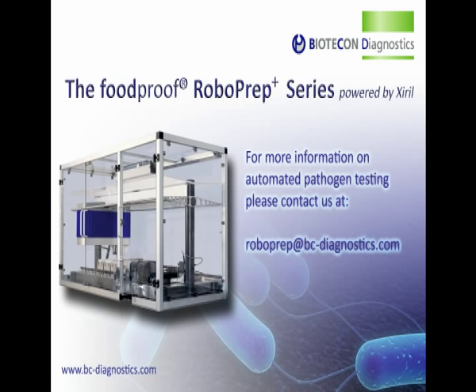In total, the entire automation process of DNA extraction and PCR setup using the food-proof RoboPrep Plus 158 workstation takes just 2 hours and 40 minutes for 96 samples, leaving additional time for other necessary laboratory activities, which further increase a lab's throughput ability.